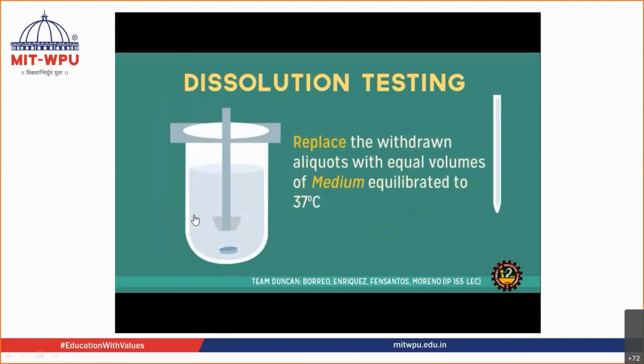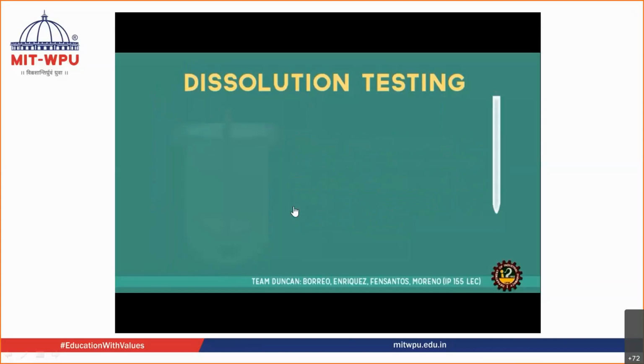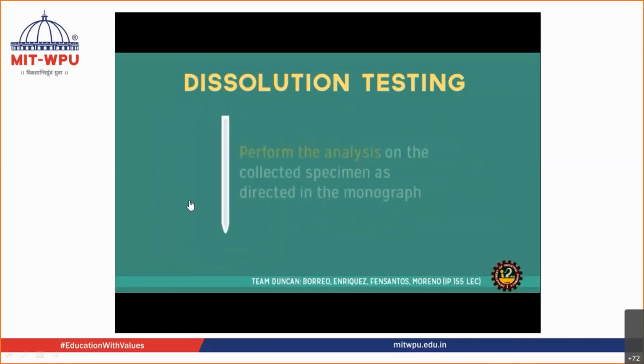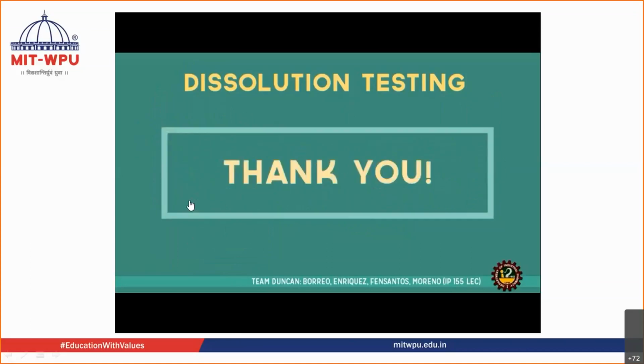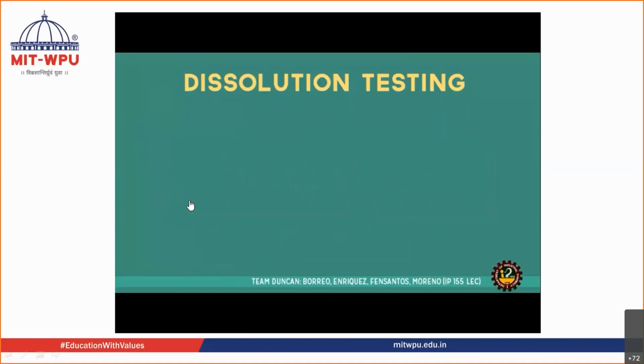After some time, when you take the sample, I'll tell you what the sink condition is a little bit later. And then you perform the analysis. Okay, got it?